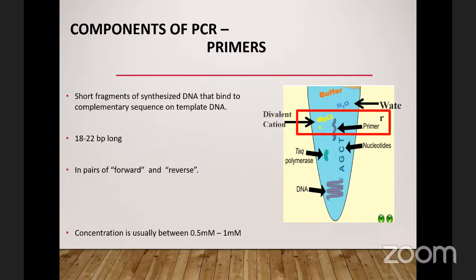And then we have the fact that they are in pairs. We have forward primers and we have reverse primers. Please, I do not want us to actually bother about all of these details. We are actually giving you these details because we are professionals and we need to have understanding of what happens in the reaction tube.